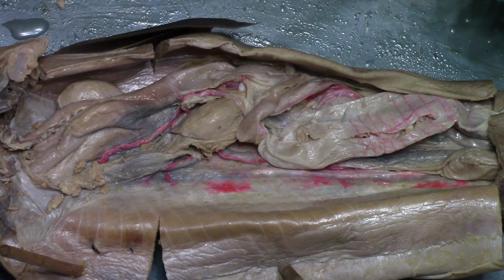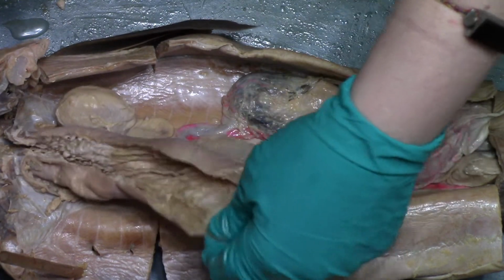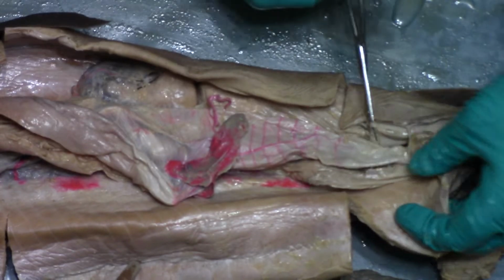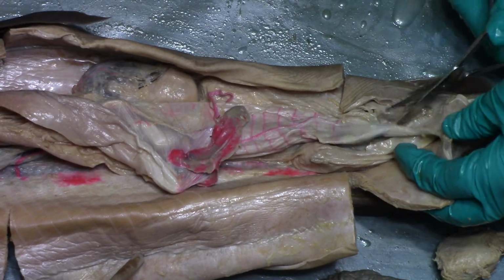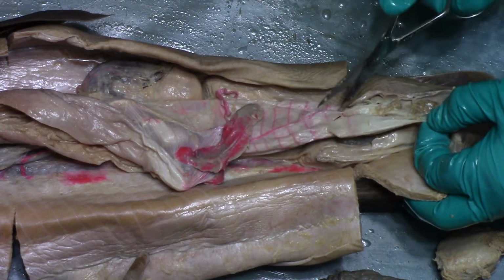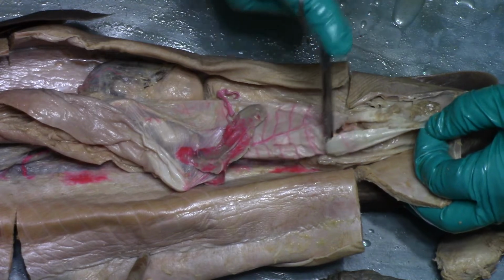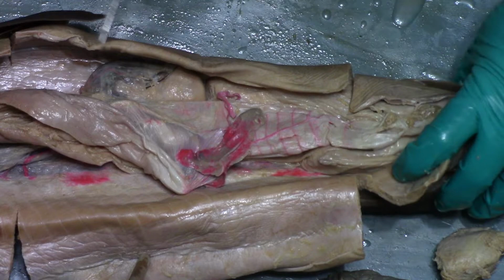So this is one of the easier critters, like their digestive tract I find is quite easy to find and figure out. All the way down to our anus. So like I can cut up through the cloaca up into the colon and into the ileum. Which is neat. Okay.